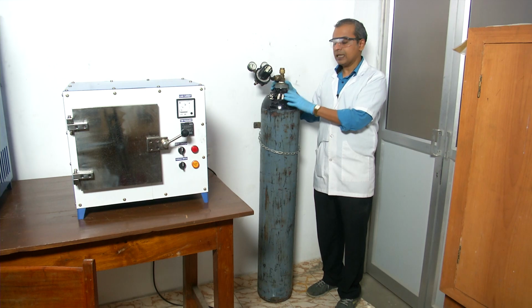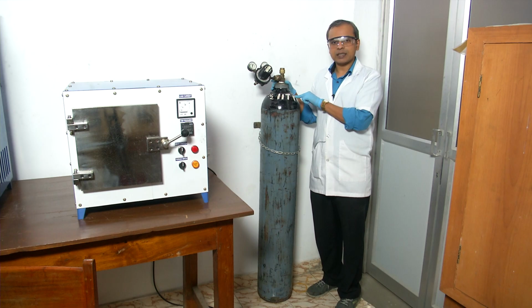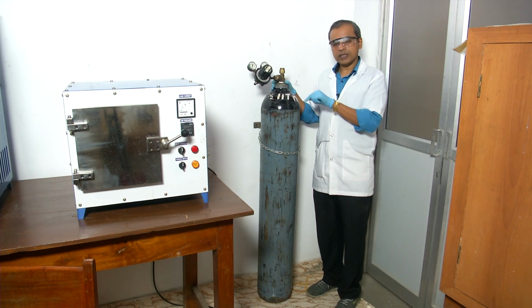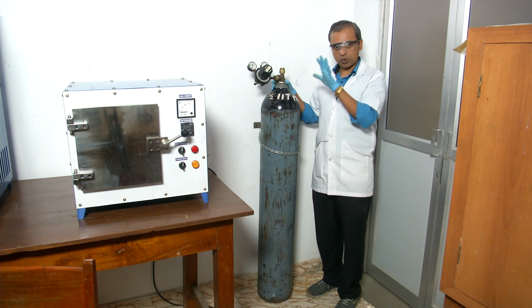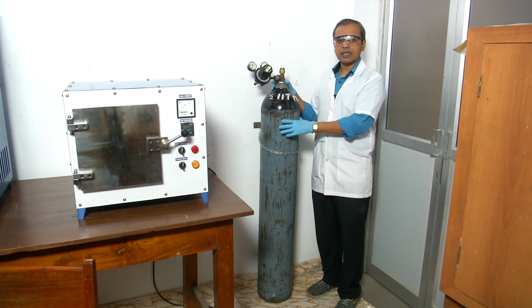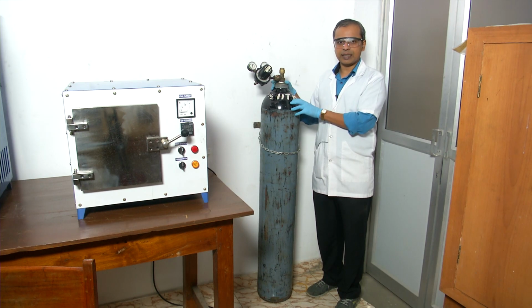So, you must have it properly set up in this particular manner, and that is a very important aspect of safety associated with gas bottles. Incidentally, the same safety would also hold if you have to transport the gas bottle. Typically, to transport the gas bottle, there are trolleys. Those trolleys will have an identical arrangement, so that the gas bottle is loaded onto the trolley, and there will be a system which secures the gas bottle and prevents it from falling down. That would be very similar to what you are seeing here. There will be some kind of a chain that goes around the gas bottle at an appropriate height and secures it so that it does not fall down.